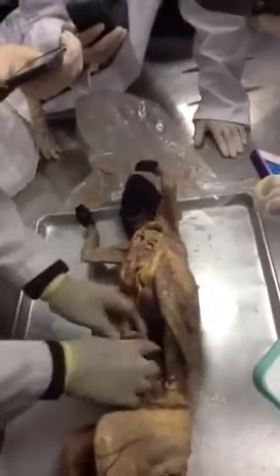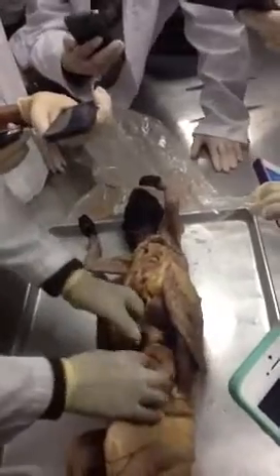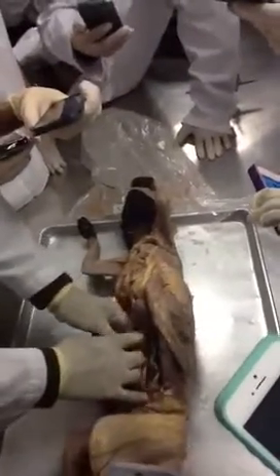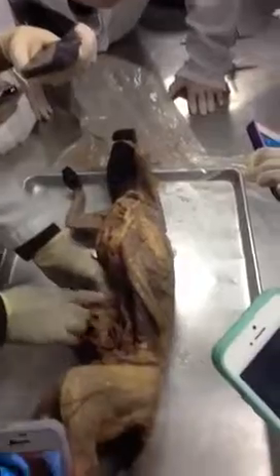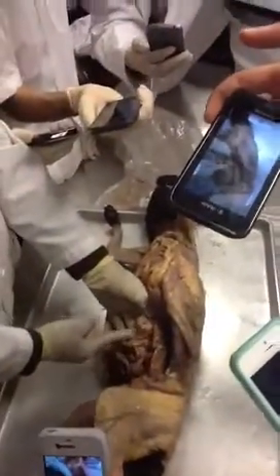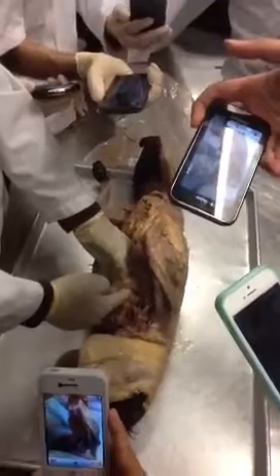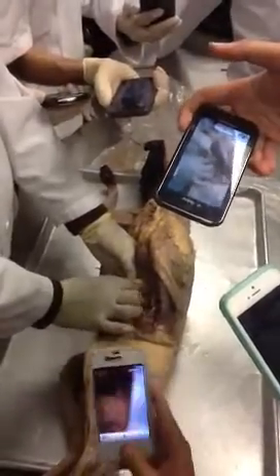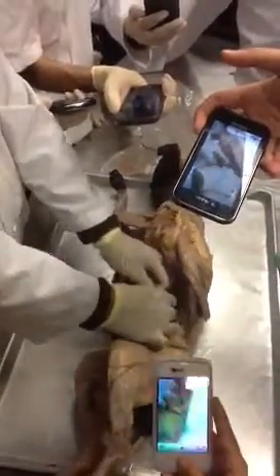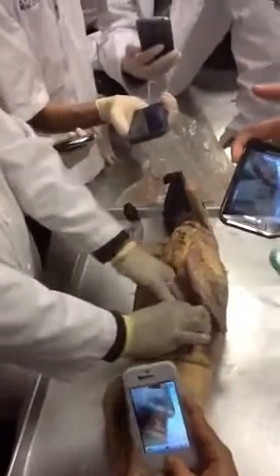You can trace it, and it begins at the stomach right here, and at the end you will find that the small intestine enters somewhere. So this is the large. Can you see that this tube is not continuous? This tube is entering into another big tube. So which one's the small, which one's the large? The smaller one is definitely the smaller caliber one, and this one is having huge caliber, right? This is the large intestine, alright?